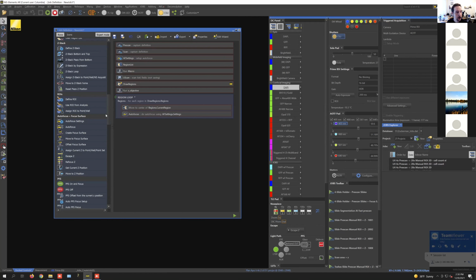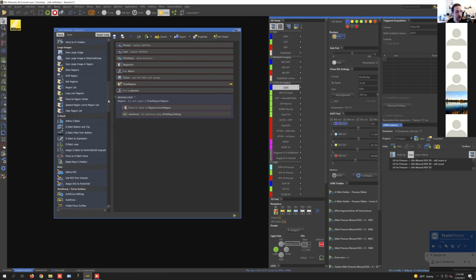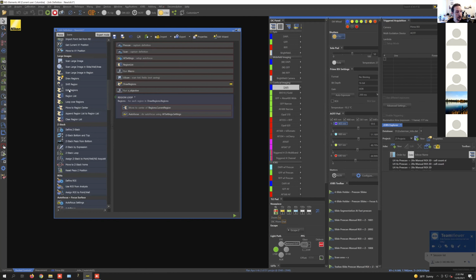And then finally, we want to image those regions. So in here, we're using a different one now. We're actually scanning the ROI. And so this ROI might be sort of amorphous. It might not be a rectangle, and we don't want to waste any time imaging a full rectangle if we really only want exactly where the tissue is. And that's what this tool allows us to do.